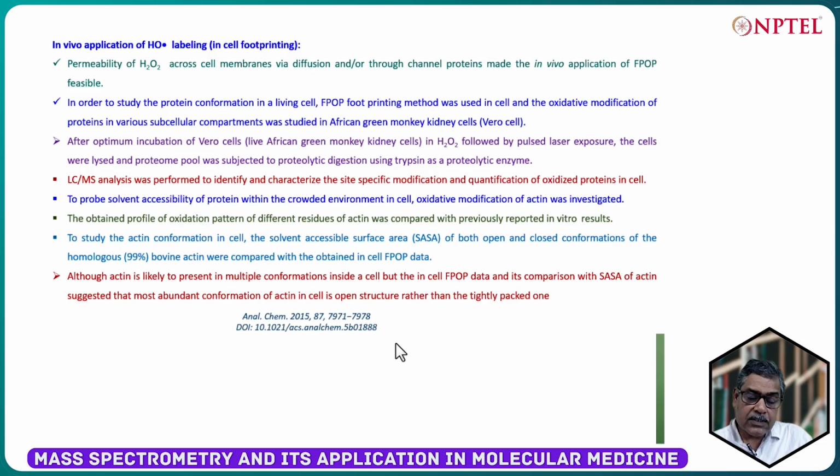Okay. So, with this I will stop today's class on fast photochemical oxidation of protein based footprinting of protein molecules to understand different biological events starting from its structure, structural transition and so on and so forth. In the next class, which is going to be the last class in this course, we will discuss something else which has direct application in the industry.